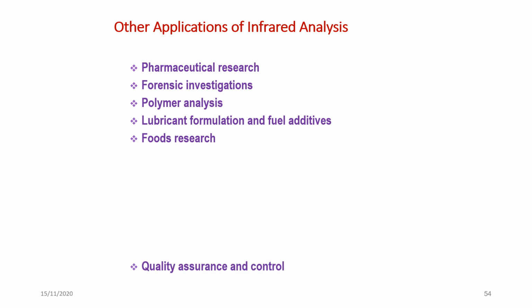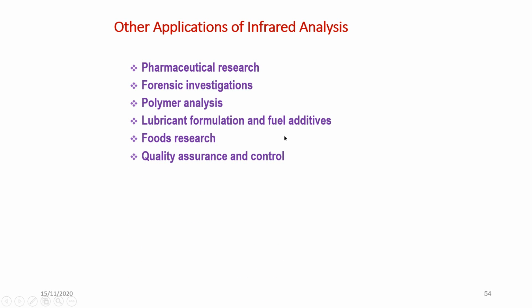So these are some of the applications of IR spectra, and it is now an indispensable part of the research field, and especially in the medical field, pharmaceutics, forensics, polymers, food, everywhere, to study the nature of the bonds, to study the nature of the molecules. IR spectra is definitely a tool which is used in elucidating the structure of the molecule.